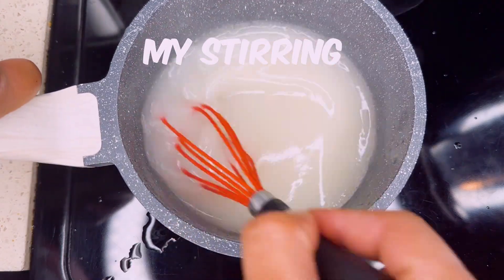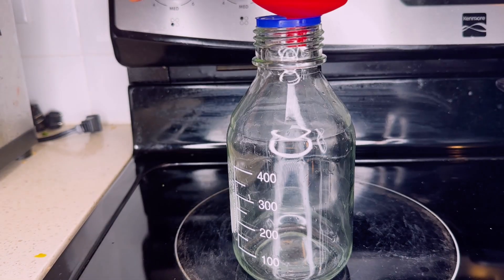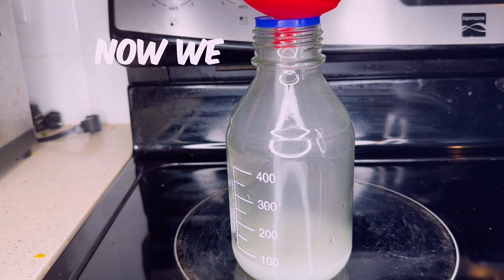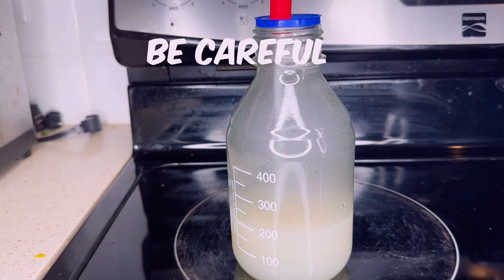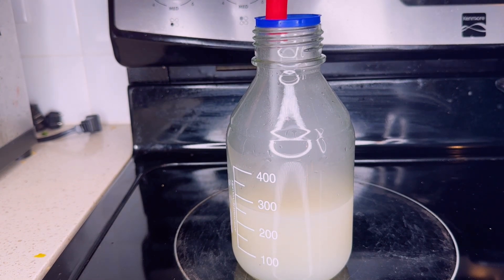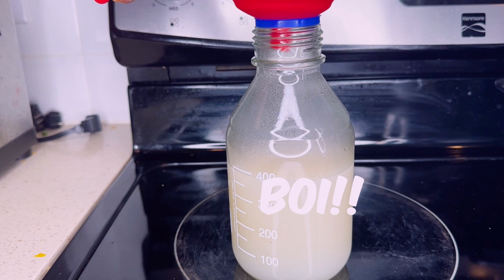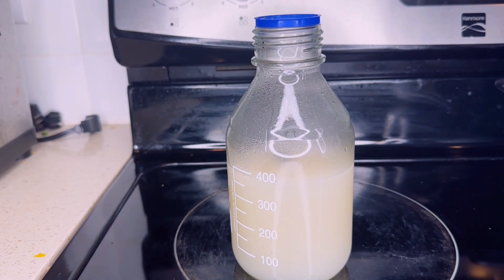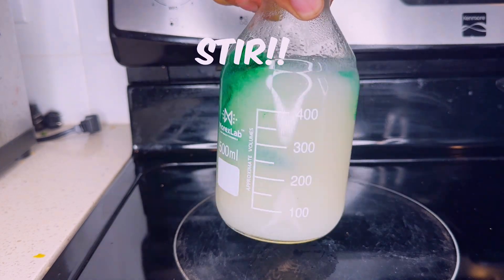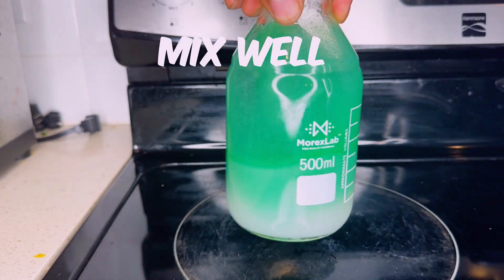Don't mind my stirring — I just like to make sure everything is mixed up. Now we're going to pour our concoction into our bottle. Make sure you be real careful with this because it's real hot. It'll burn you like a pudding burn. And add a couple drops of this here magic sauce — the food coloring. Give it a big stir because it doesn't like to mix all the way.